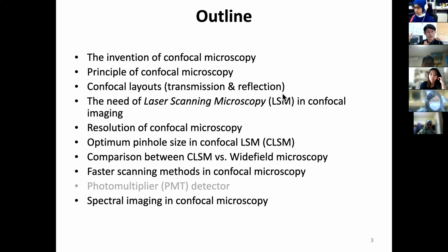It only provides fluorescence. So the confocal microscope's reflection mode is also another very nice way of giving us contrast without any label. And confocal, when we say it, usually involves laser scanning. So we usually call it LSM, or laser scanning microscopy. And let's think why these are necessary. Also, as I said, confocal provides very nice resolution, which is better than conventional imaging. So that also makes it a choice for people who are looking for more fine detail.